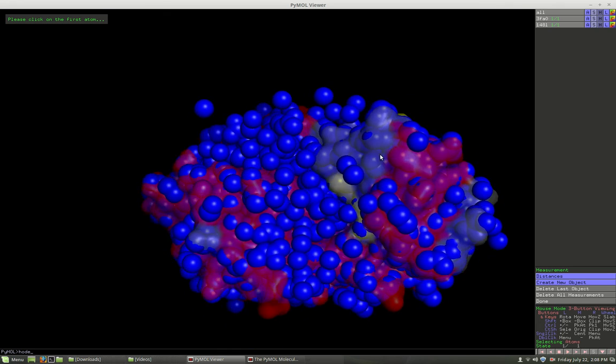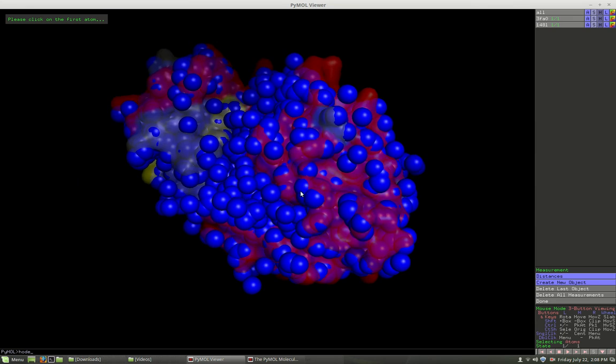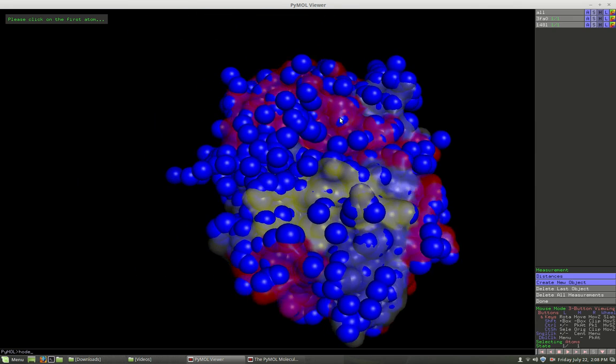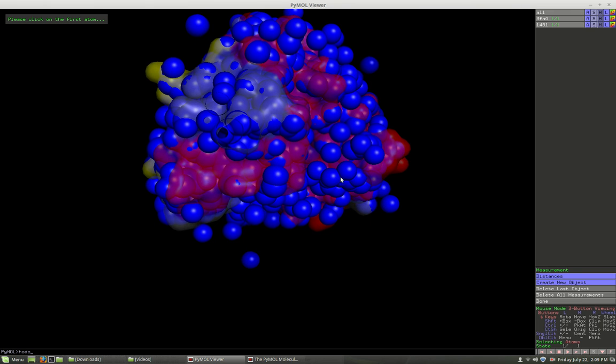And a little interesting. Not sure what you can gain by this, but it does show you that there are lots of possibilities for visualizing these molecules with the tools that you have here. All right, and that's it for this video.